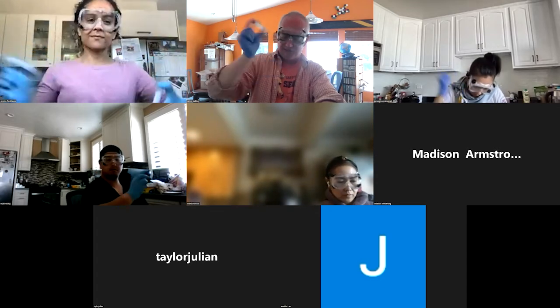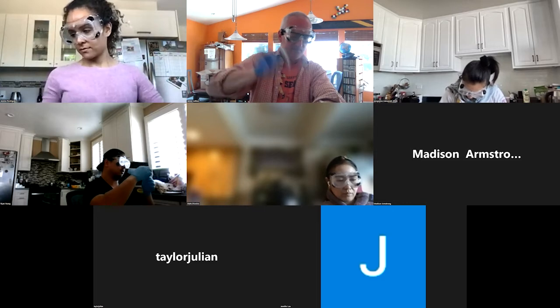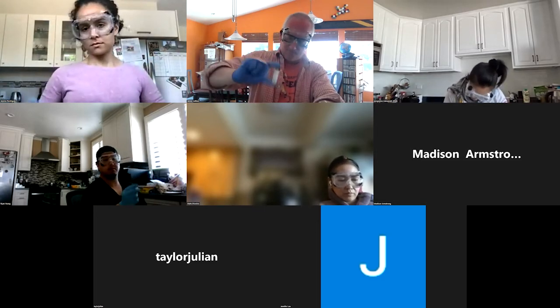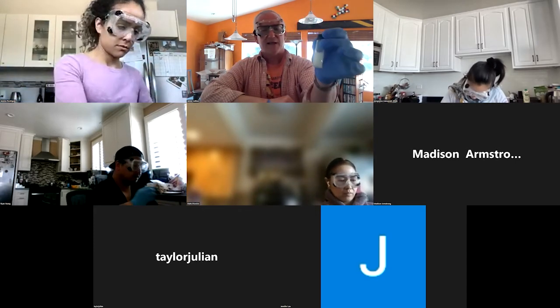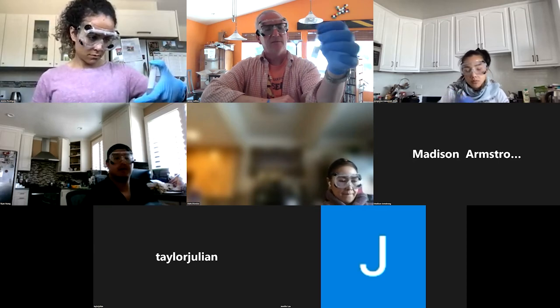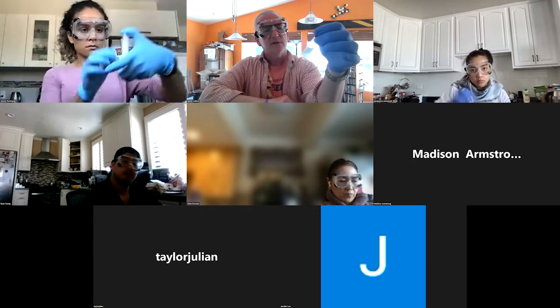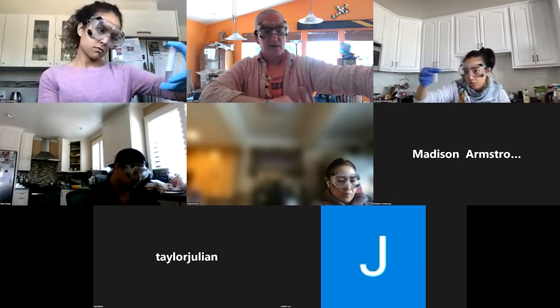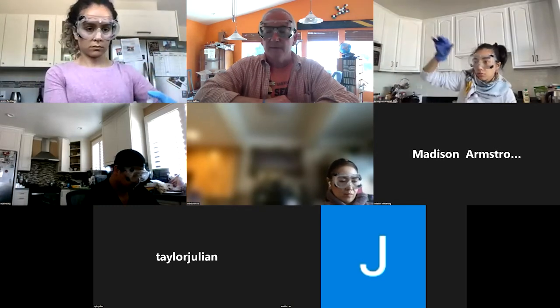I'll check downstairs. Like I said, just find some place where that won't be disturbed, and you should see a nice big lump in the middle. If you have any questions on how to proceed from there, let me know. I'll try and help you out.